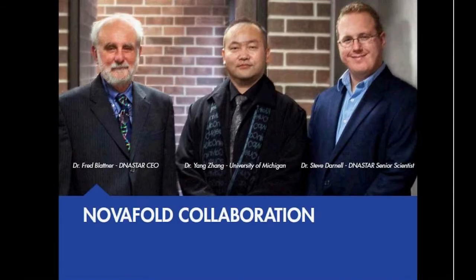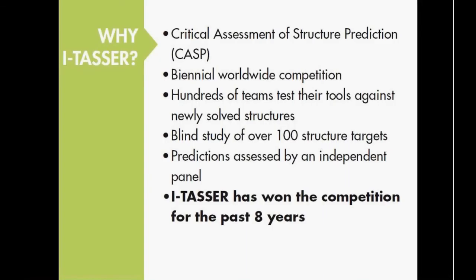Now, NovaFold as an application was born out of an ongoing collaboration with Dr. Zhang of the University of Michigan. NovaFold utilizes the Zhang Lab's I-TASSER algorithms to build accurate, full 3D atomic models of proteins with previously unknown structures. So why this I-TASSER algorithm for our particular application?